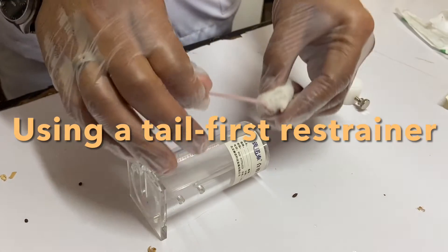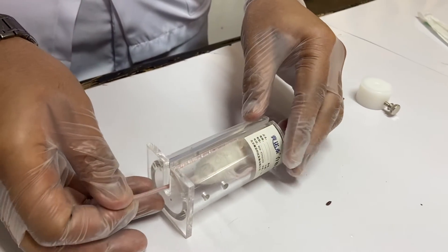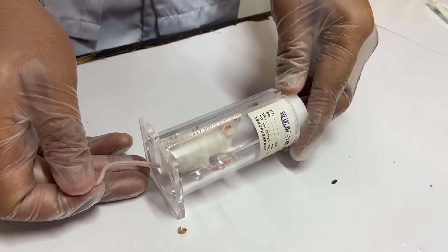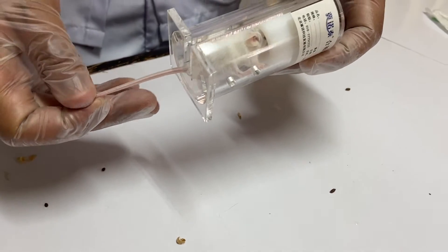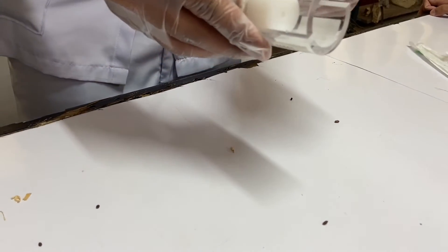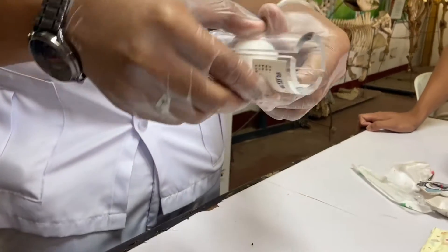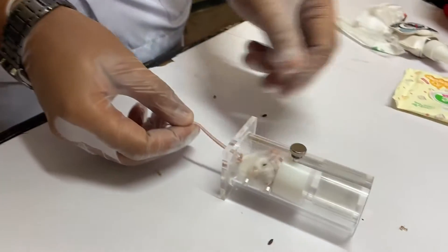Using a tail-first restrainer: lift the mouse by the base of the tail and place it in front of the open end of the tubular device. Step 8: introduce the mouse backwards with its tail being gently pulled along the open longitudinal slit. Step 9: slide the head button into the tube up to the animal's head to prevent the mouse from moving forward.